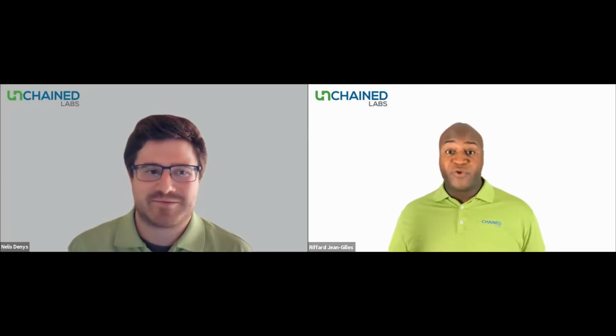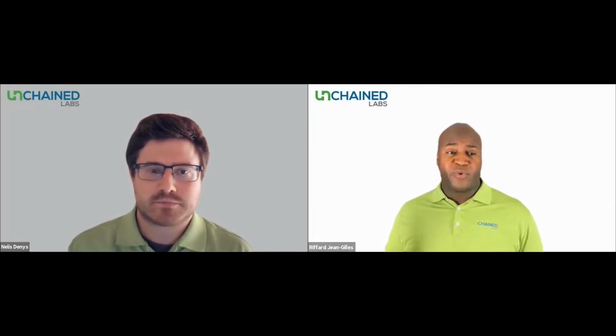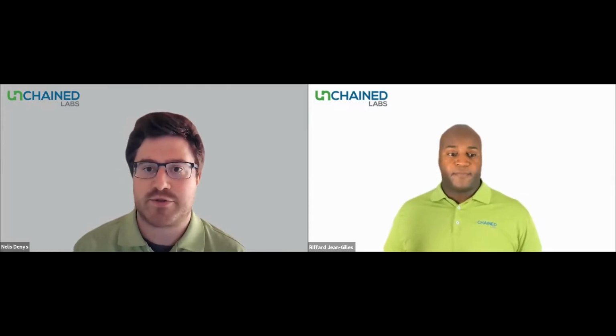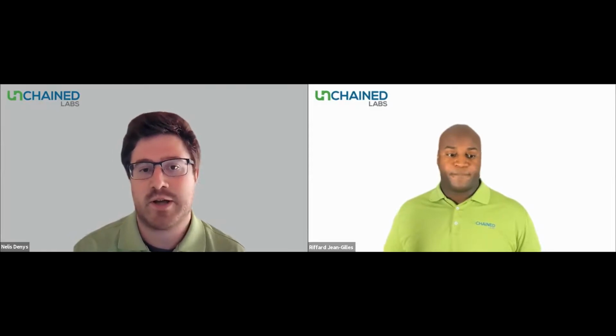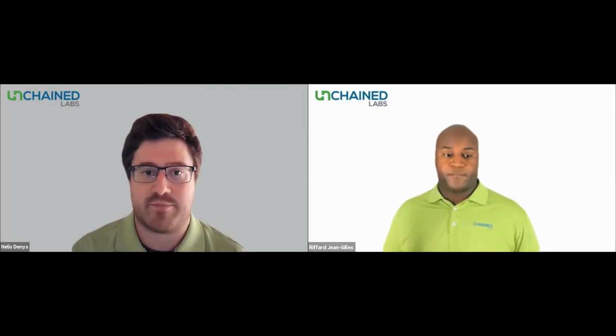Excellent. So to the audience, I'd like to welcome you to join us in the Q&A. We have some questions there. I'm going to begin from the top one. The first one is, can the pharmacopoeia test be done by the user? So can I do the pharmacopoeia test myself is the first question. Yes, so next to the services we offer, it is also possible to purchase the cuvettes from a third party because they're third party certified. And then you can run them as many times as you want within the software. Sounds good. Thank you very much.